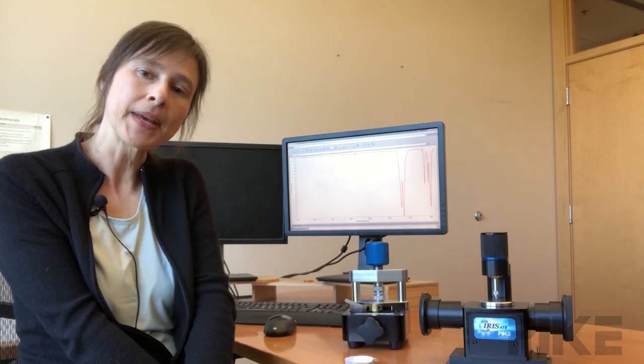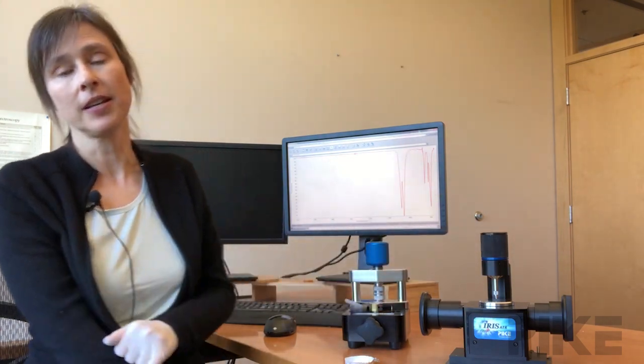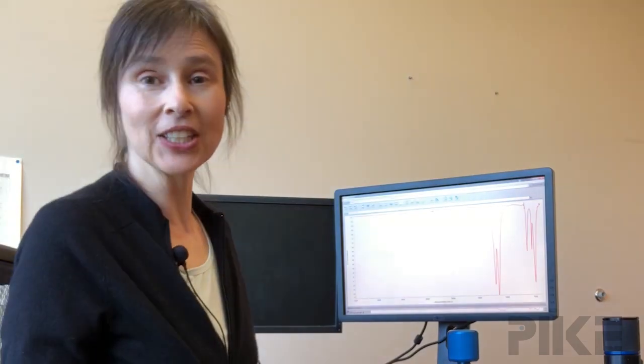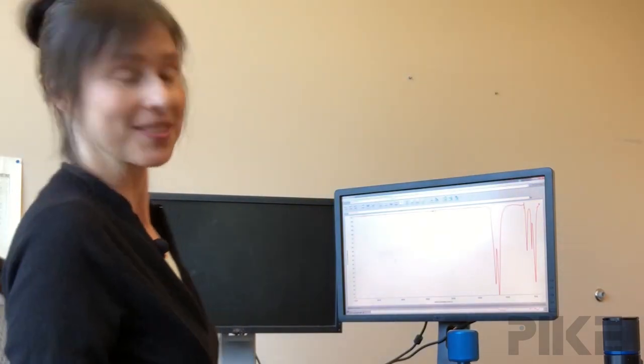I also collected the ATR spectrum on Iris, our diamond ATR. So let's take a look at the results.